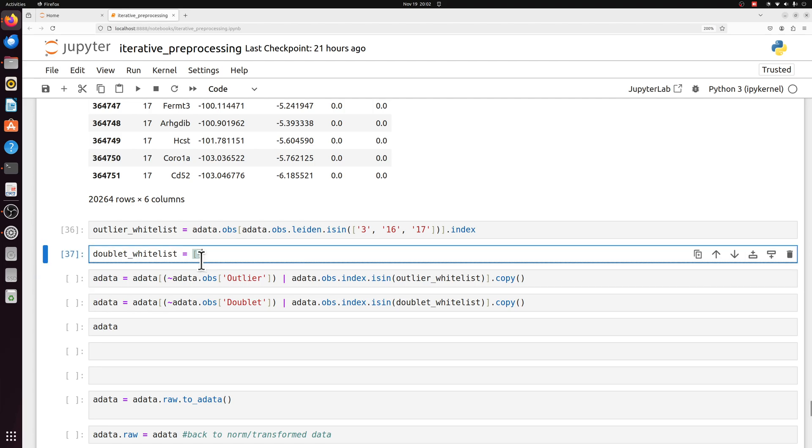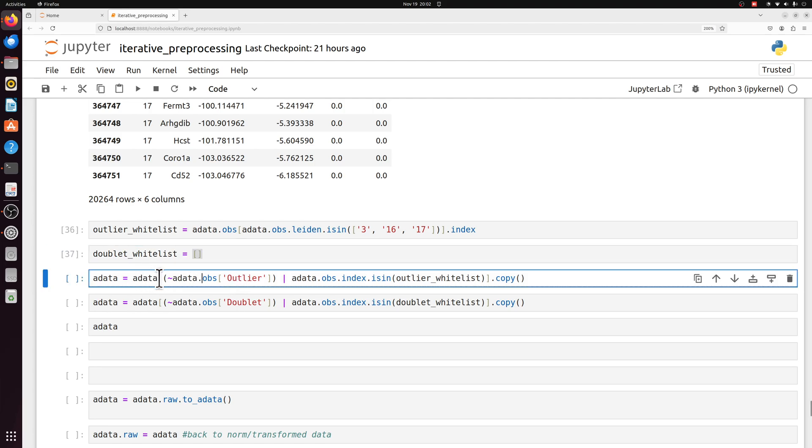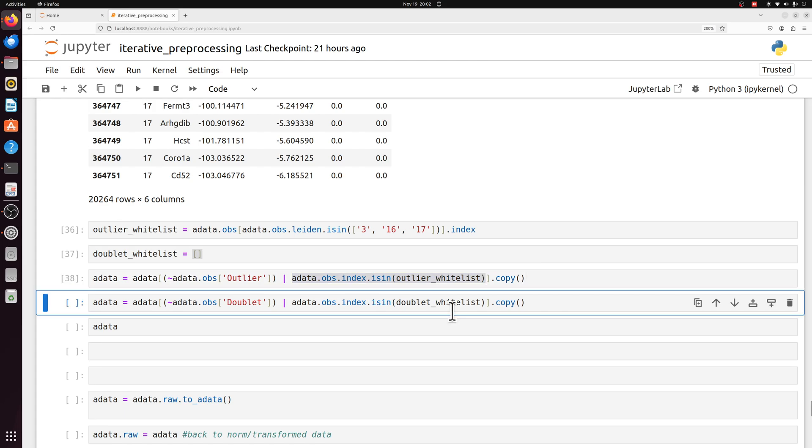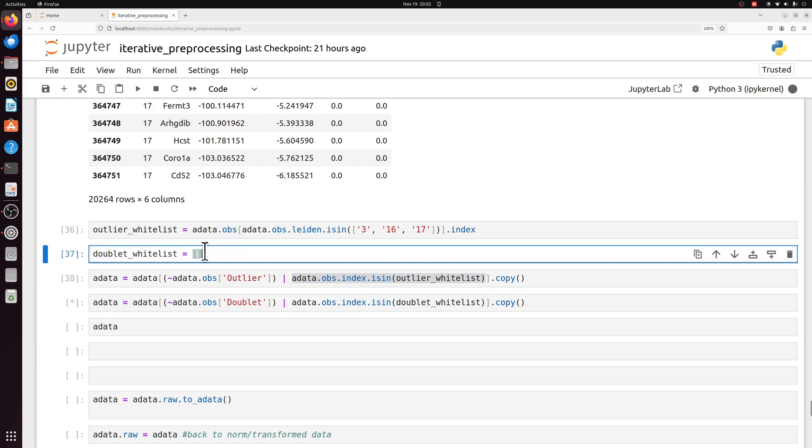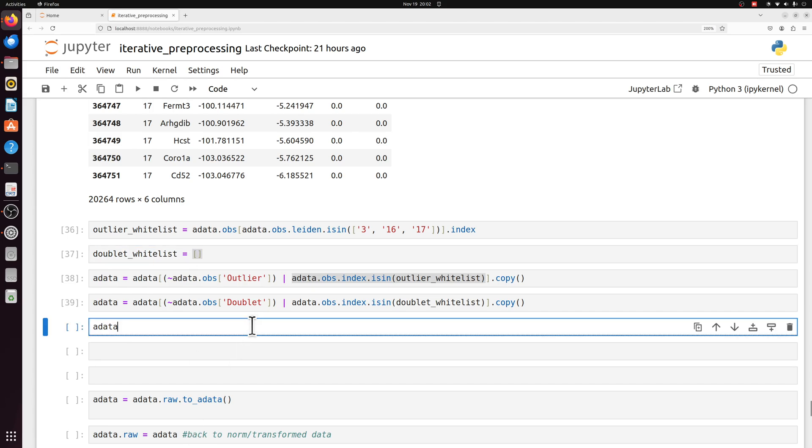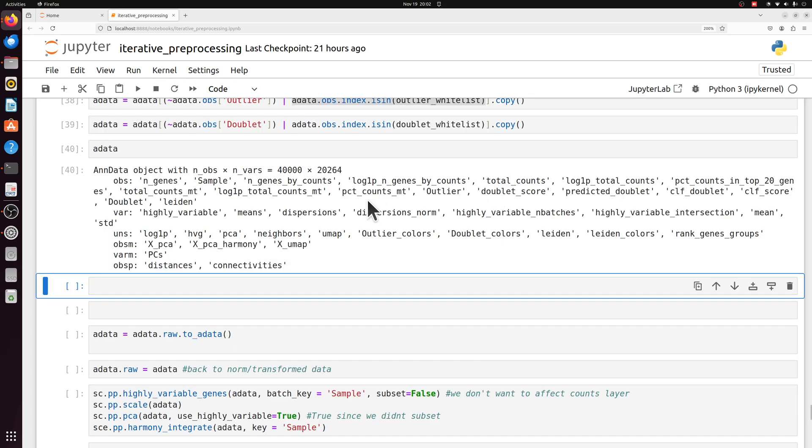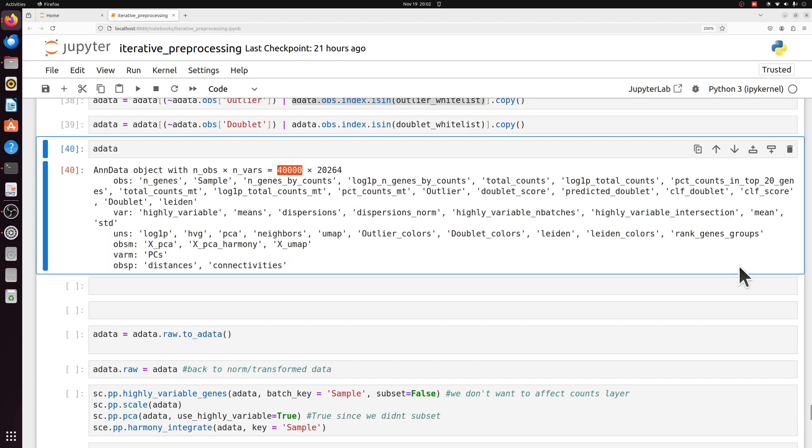Let's pretend none of the doublets were real cell types. So we're just setting this as a blank list. But what we're doing now is we're saying, OK, is it an outlier? Because outliers were labeled true. But if it is an outlier and it's in that whitelist, we're going to keep it anyways. And then same for the doublets, but we don't have any in the whitelist. So we're just getting rid of all the doublets. So we have our adata object, which interestingly ends up being exactly 40,000 cells.